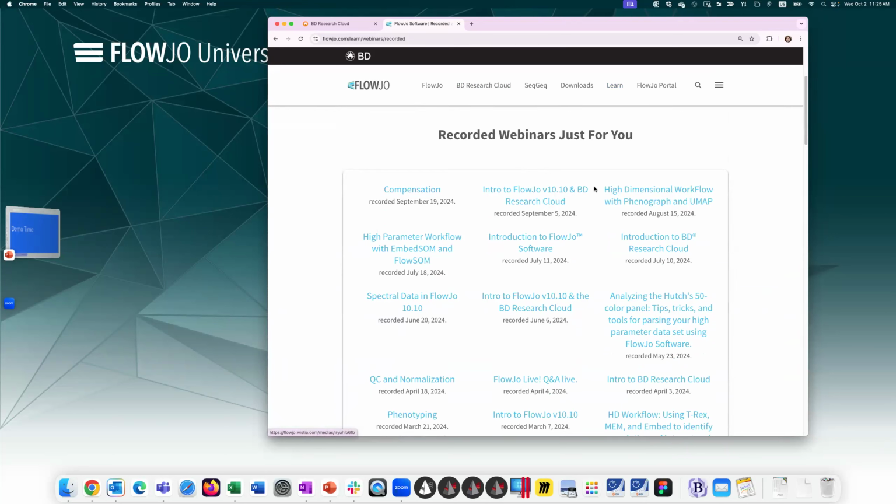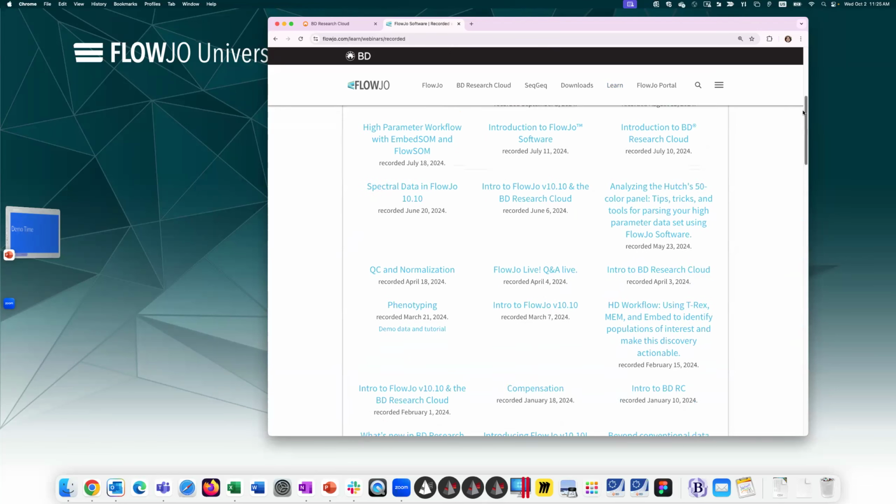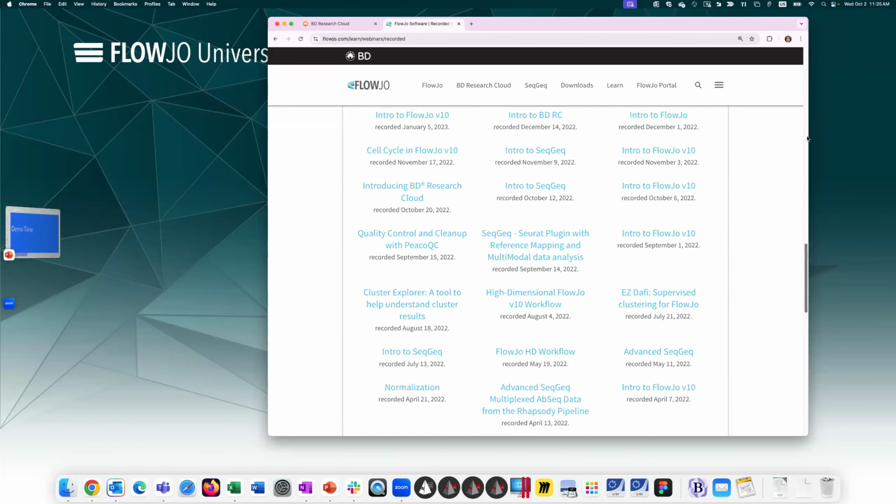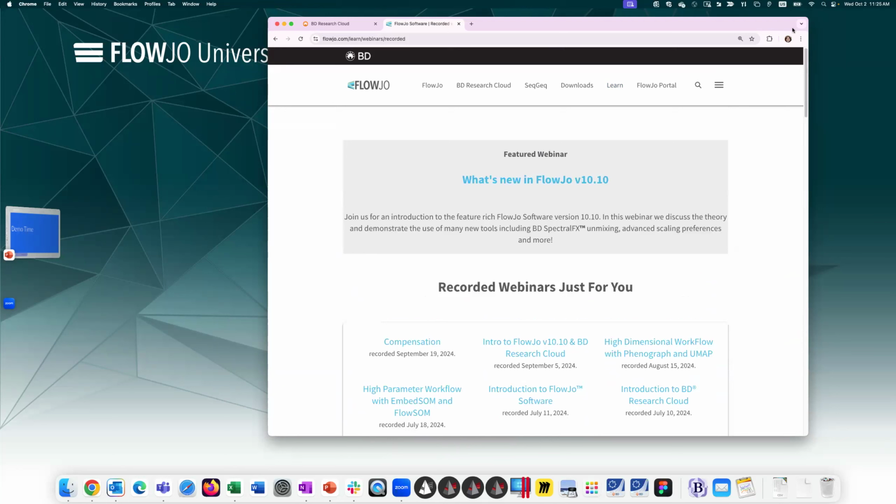Intro to FlowJo 10, BD Research Cloud, high dimensional workflows. And then you can see we have lots and lots of great webinars that are all recorded and available for you to watch when it is convenient for you.